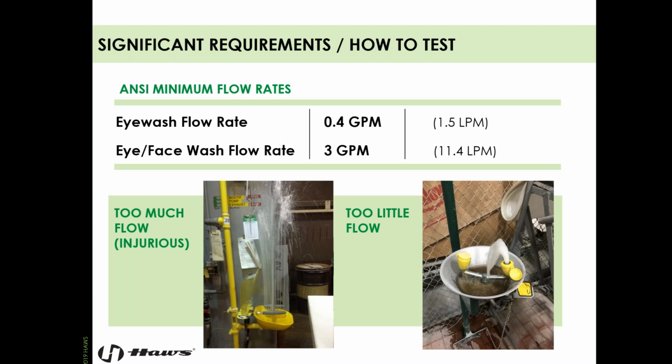Now here's a couple examples. You have too much flow, what's considered to be injurious flow, something I like to call a brainwasher, on the left, and then you have too little flow on the right.